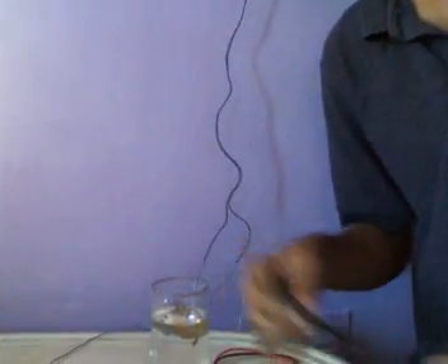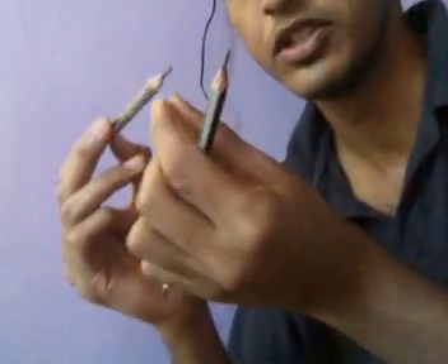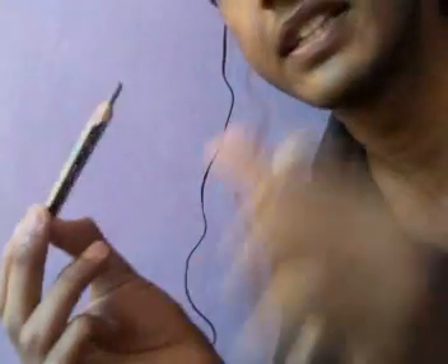Today I will tell you how to prepare sodium hydroxide the easiest way. For this you will need two pencils with their ends removed. You will see that the graphite is exposed. This acts as an inert electrode.